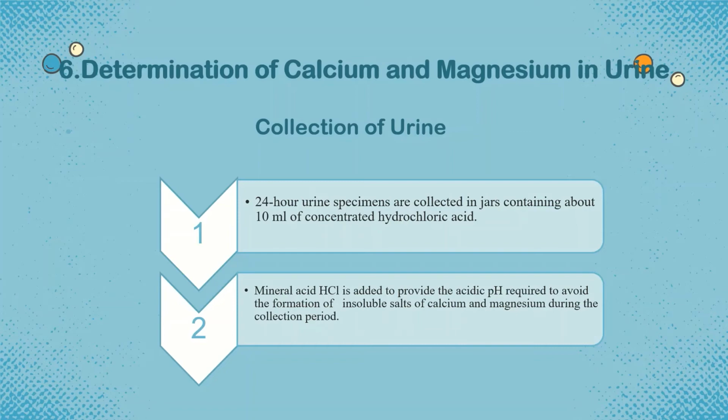Now the question arises why we need hydrochloric acid. Hydrochloric acid definitely provides an acidic medium, but that acidic medium is required to avoid the formation of insoluble salts of calcium and magnesium during the collection period.